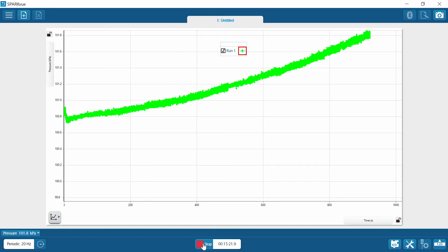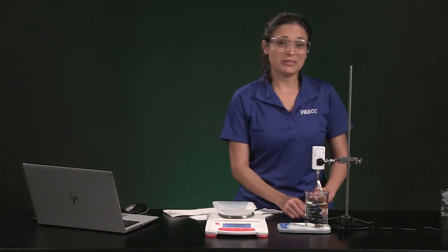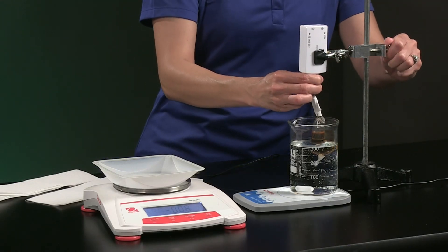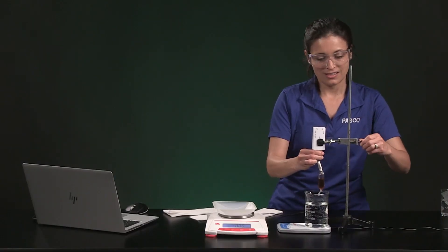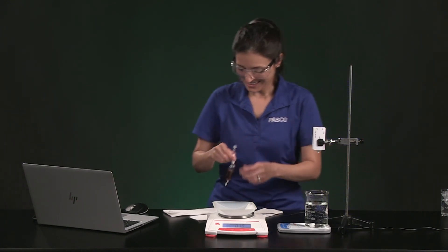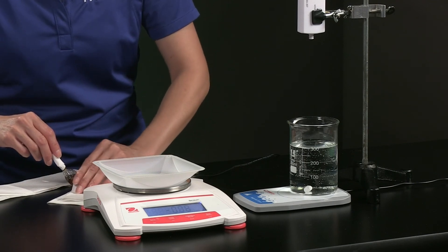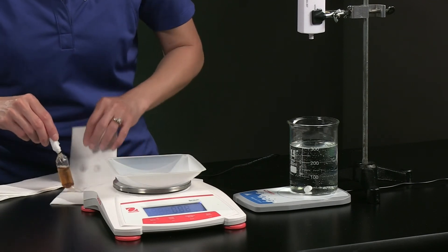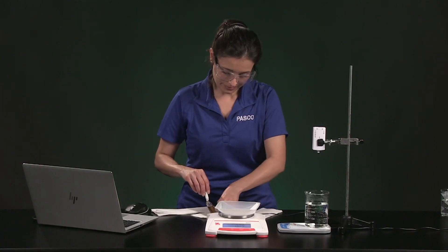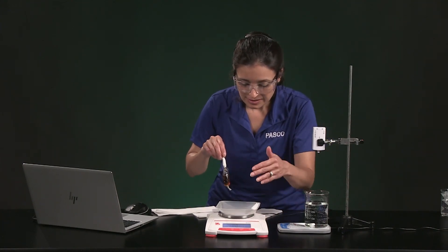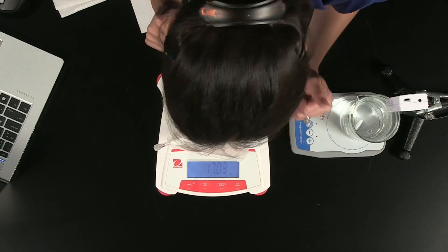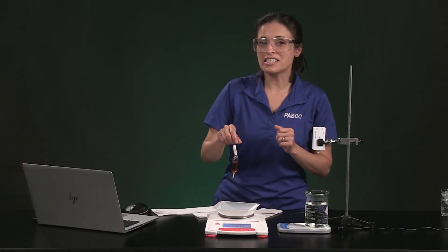I am going to stop collecting data. And now we can record the final mass for the syrup bag in table 1. I am going to turn off the magnetic stirrer, let me dry the bag and get as much water off as possible. The mass is 17.13 grams.